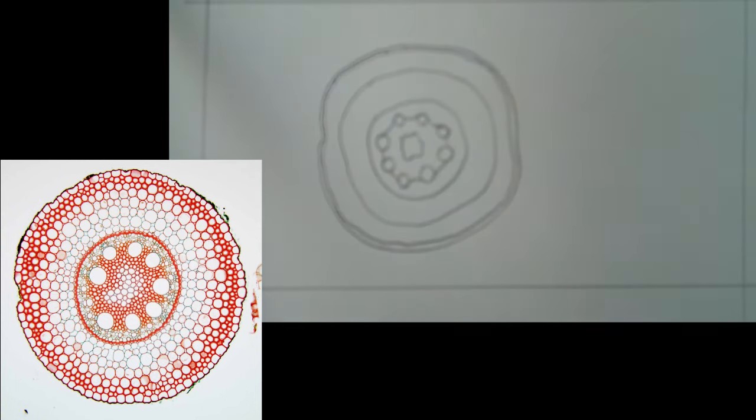Okay, and really what I'm looking for is a difference in cell shape, a difference in maybe the thickness of the walls, which here is maybe a little bit difficult to see, or a difference in staining, and that's probably here. You can see that quite clearly. So I think that would probably be it.